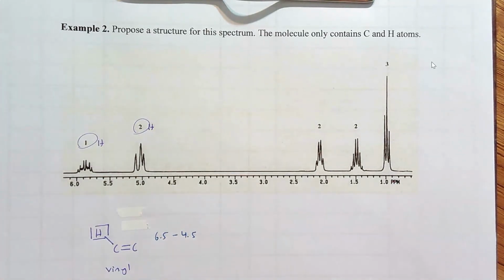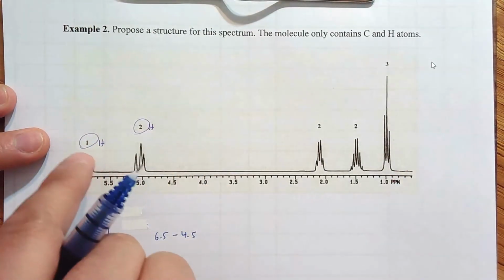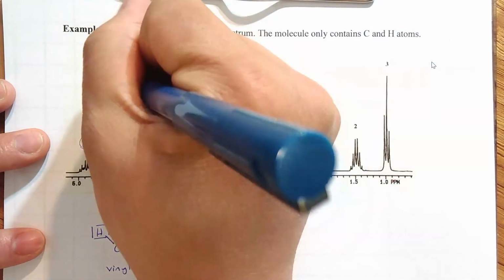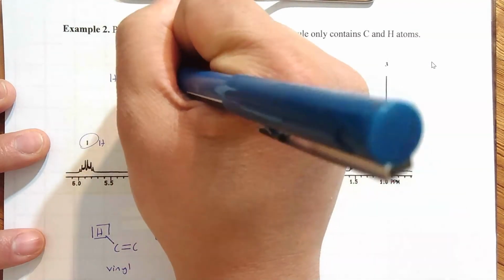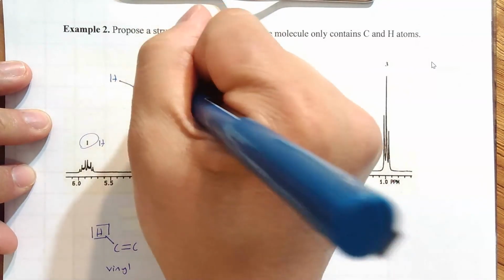This is a guess, okay? But I'm guessing we have a double bond, but I'm also guessing that that double bond is responsible for these 3 hydrogens. How? 1, 2, 3. Okay? And then the rest of the molecule.